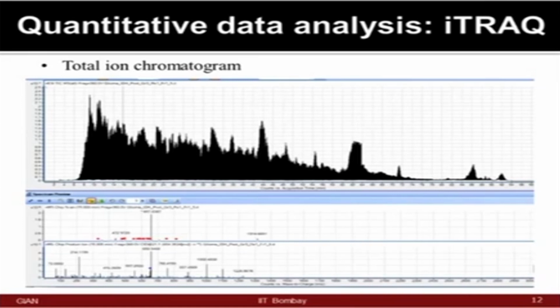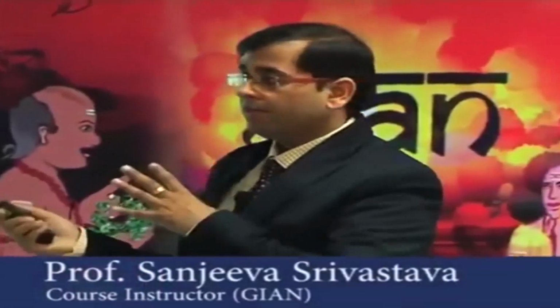They are very fast, but still the way your ions are passing in the mass spec and the MS scan speed, these two things you have no control over. So, one way you can control that is to have the pre-fractionation, so that fewer peptides and fewer ions are coming each time, and later on you can pool all of this information to generate the entire proteome coverage, because when we say we are interested to know about, let us say, all the 5000 or 10,000 proteins in a given sample.